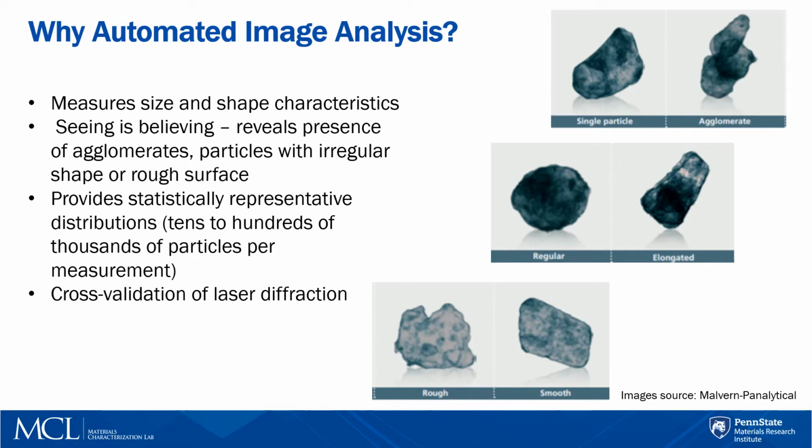Automated imaging is often used in conjunction with other particle characterization techniques to gain a deeper understanding of the sample or to cross-validate particle sizing methods.